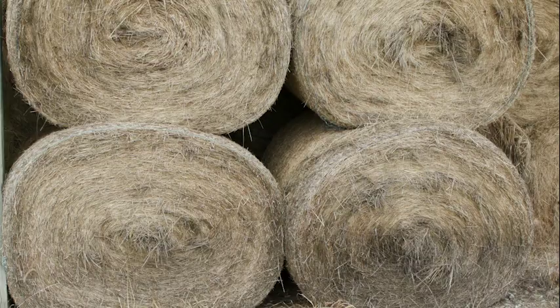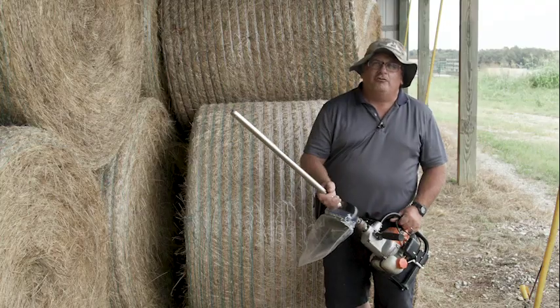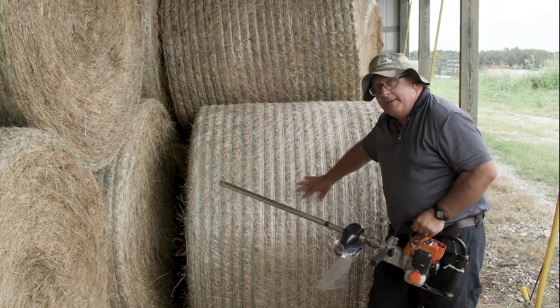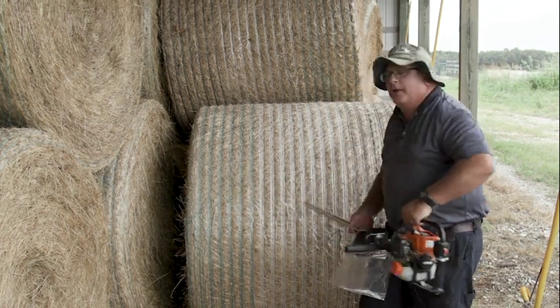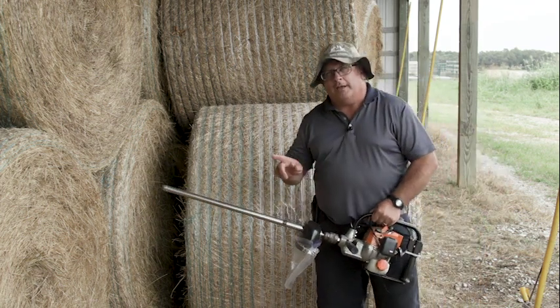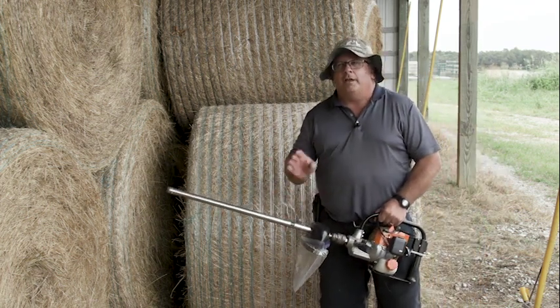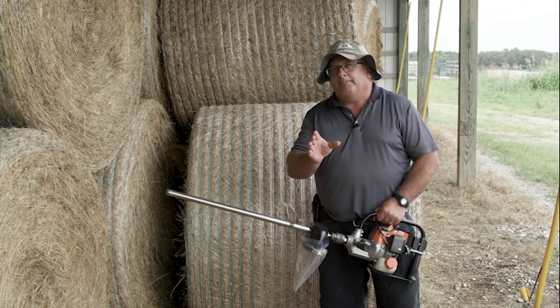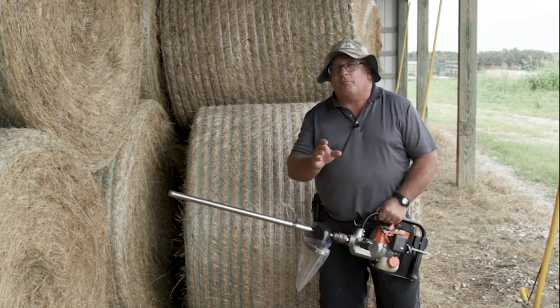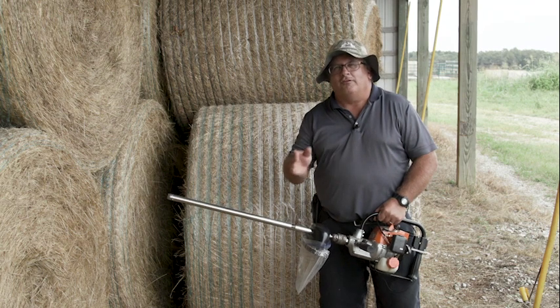It's important when sampling hay that we use a probe. For round bales, we want to sample the hay from the side. For rectangular bales — large square bales or small square bales — we want to sample from the end. Again, we want to get 20 cores per lot and then submit all those cores to the lab. Do not separate them into a smaller size sample.